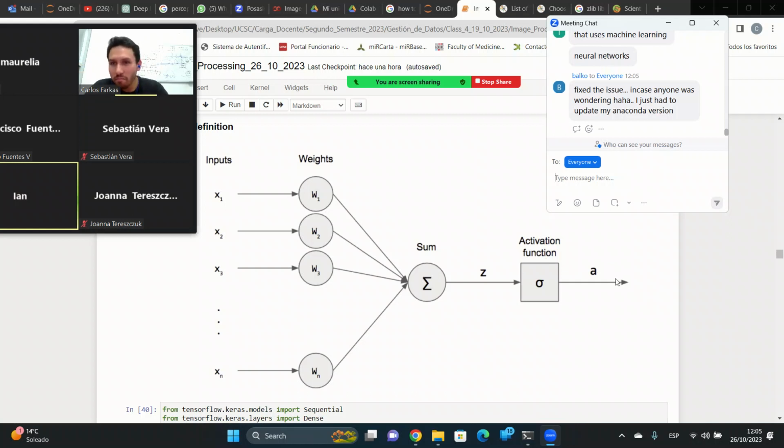Personally, I prefer to explain this by programming, but then I will address any single question you guys have, okay? So I will do some programming first. I will show you what's going on with the basic and standard deep learning processing, which is very human intuitive, and then we will go from there, okay?